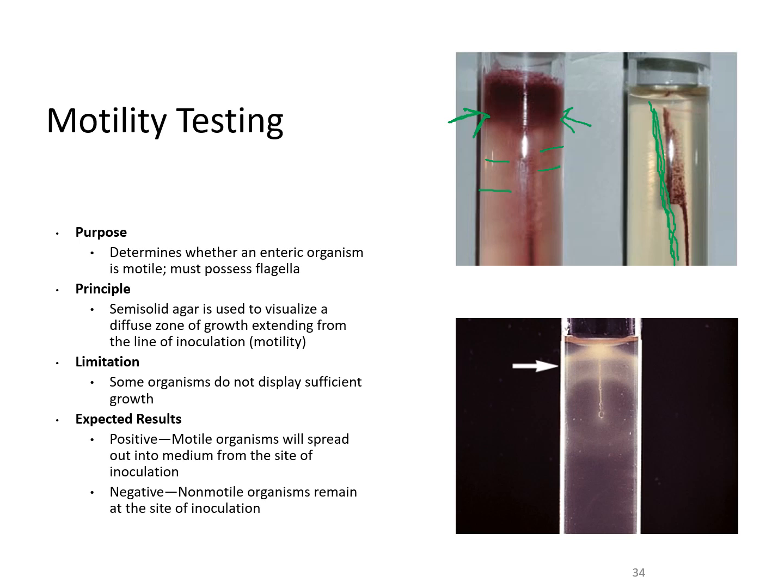So the whole agar kind of appears as a cloudiness, whereas this one is clear around those edges outside of that stab. And then of course here you have that umbrella motility from that Listeria. So you can see where it kind of forms that little circular type appearance here up top, and then you have that stab mark that comes down and creates that little umbrella look to that organism.